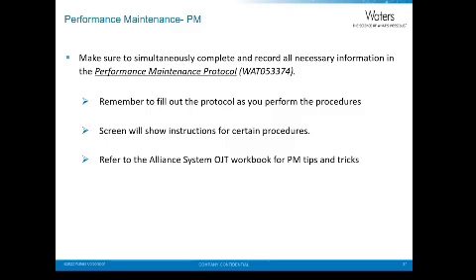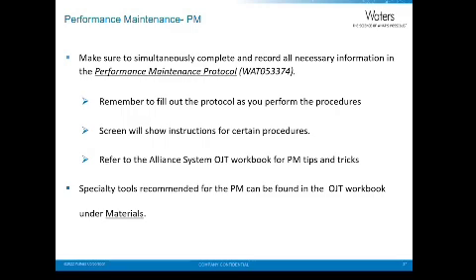Remember to fill out the protocol as you perform the procedures. The screen will show instructions for certain procedures, so follow that carefully. Refer to the Alliance System OJT workbook for PM tips and tricks. Also, specialty tools are recommended for the PM and can be found in the OJT workbook under Materials.